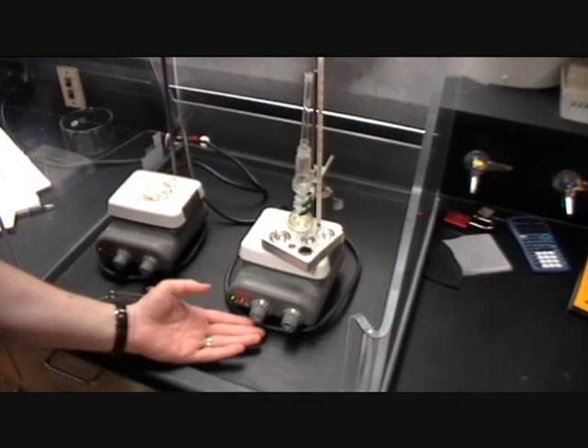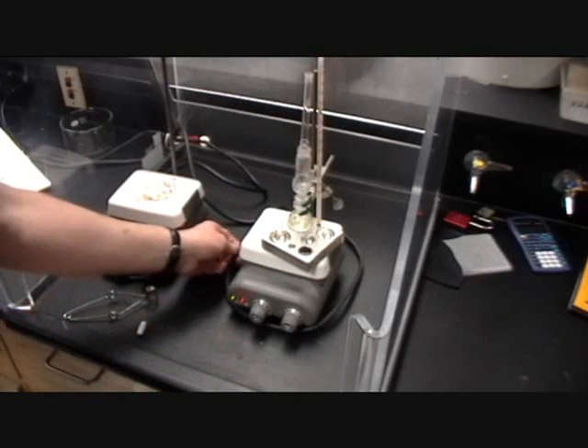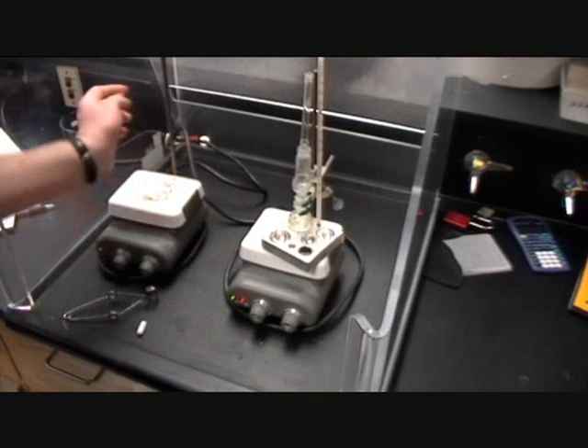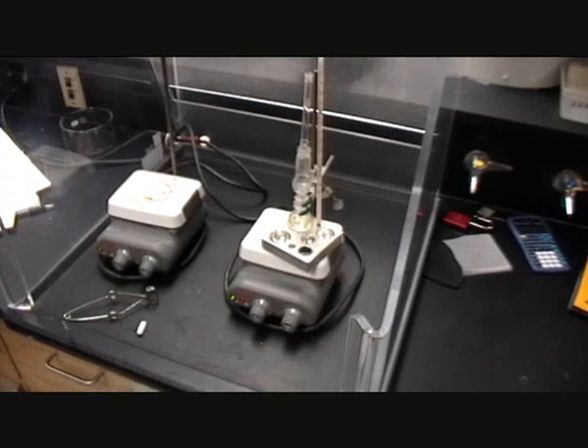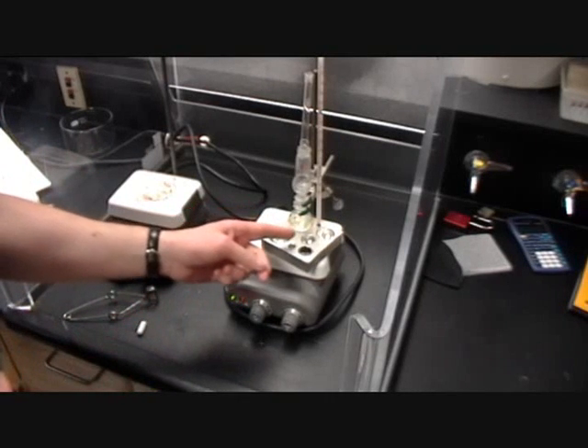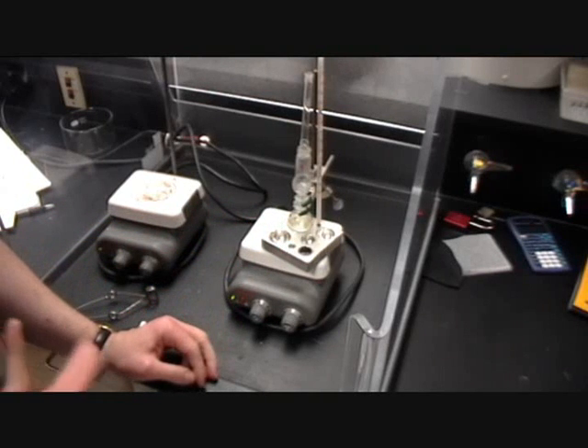If the mass no longer changes from the previous reading, you are no longer driving off water. Now, this is one of your pieces of equipment for the semester — your hot plate stirrers. Take the cable, thread it through the back of the fume hood, and connect it to the electricity supply. We can use an aluminium block on top of the hot plate to control the heat.